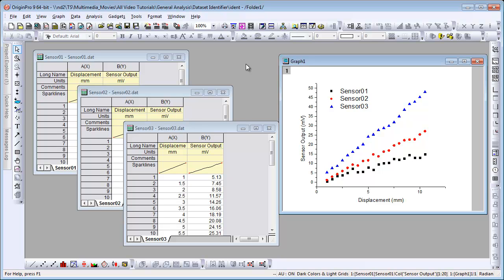Here we're looking at sensor data 1, 2, and 3. Notice the long name and units are the same in each worksheet. However, the worksheet name is unique with the sensor number.